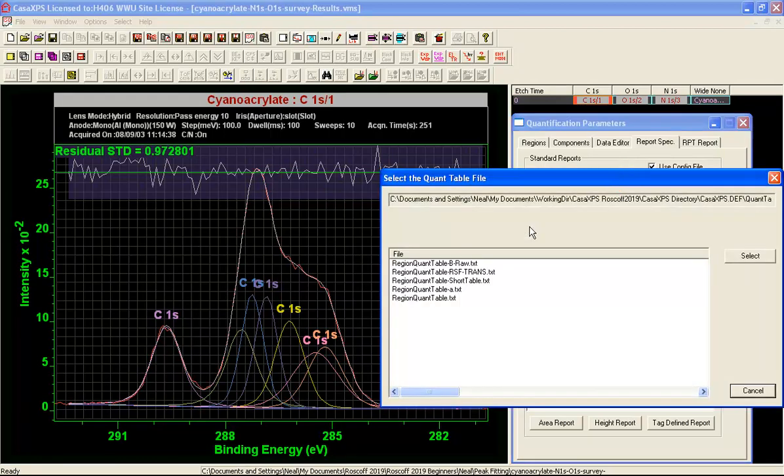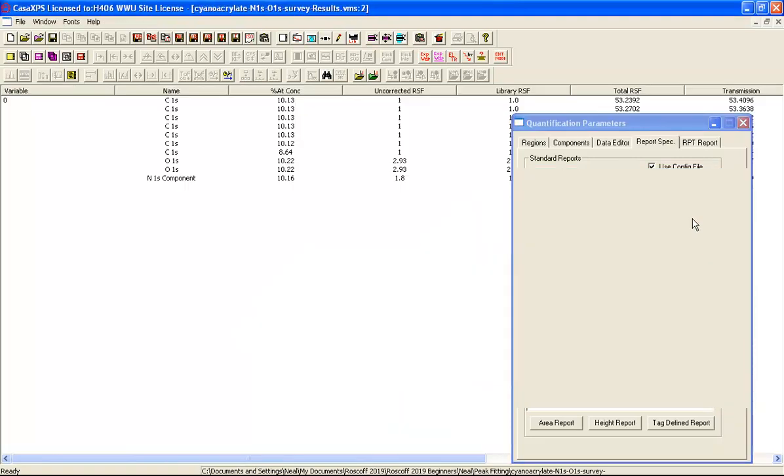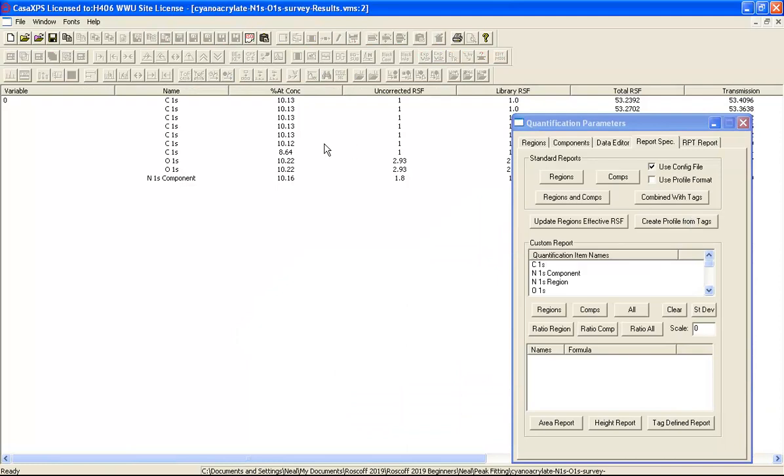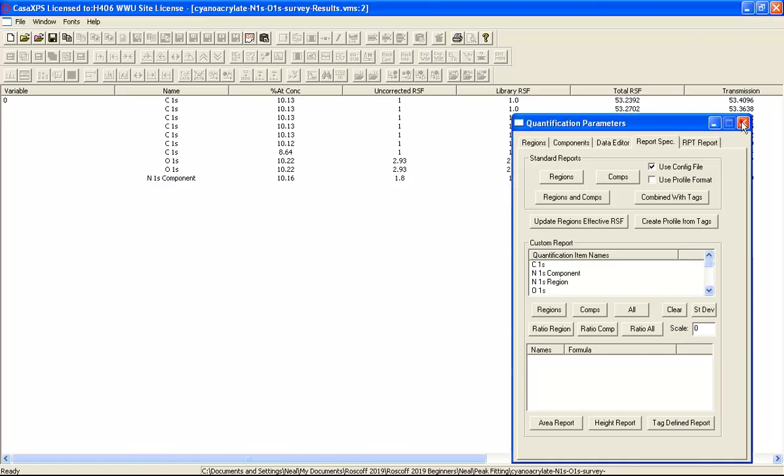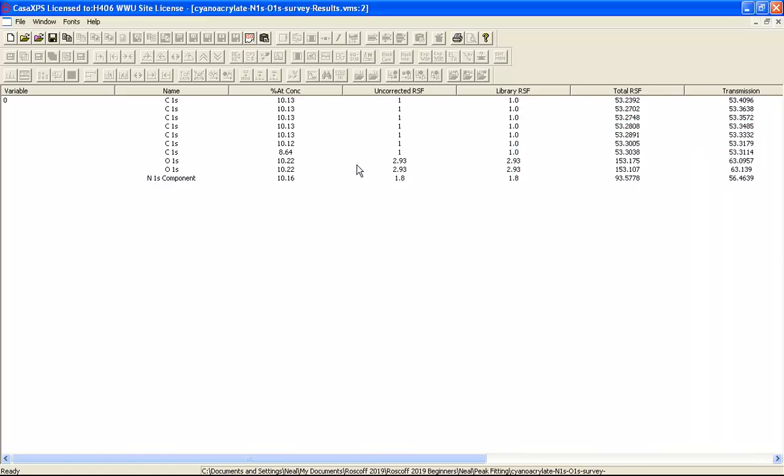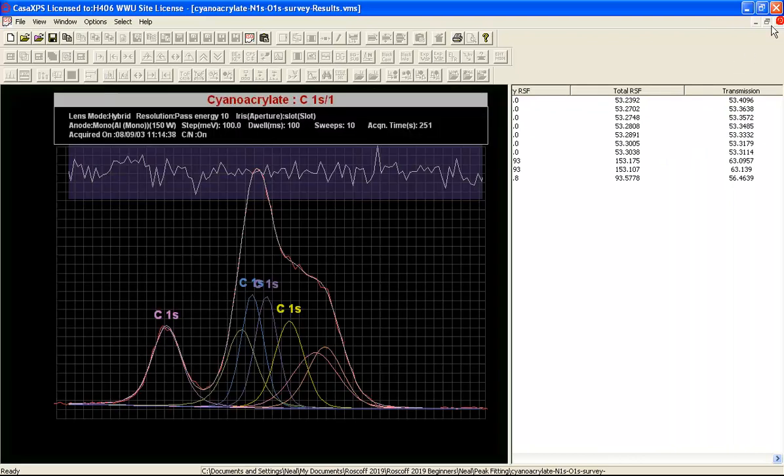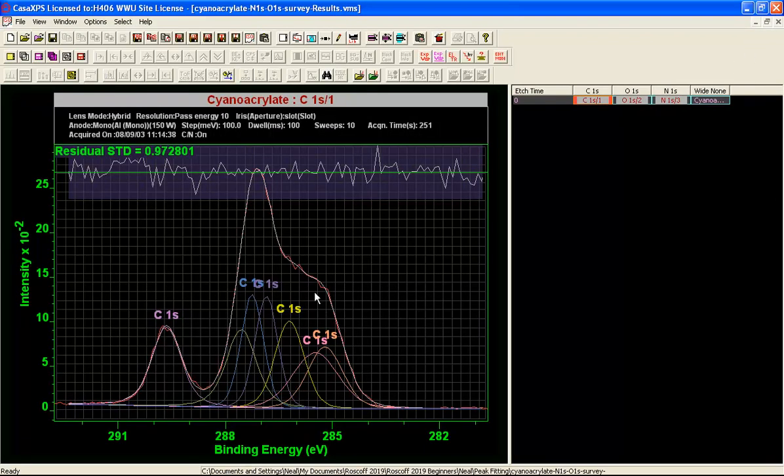When I select this button, I get a range of quantification tables, different configuration files that I can then select. And it produces a report which suggests that we have a reasonable relationship between the carbon, the oxygen and the nitrogen that would have been consistent with the material that we started with. So that's some comfort. But this requires further research, far more research than I've put into constructing this peak model to ensure that these are genuinely peaks that represent the chemistry of the material that was analyzed by XPS.